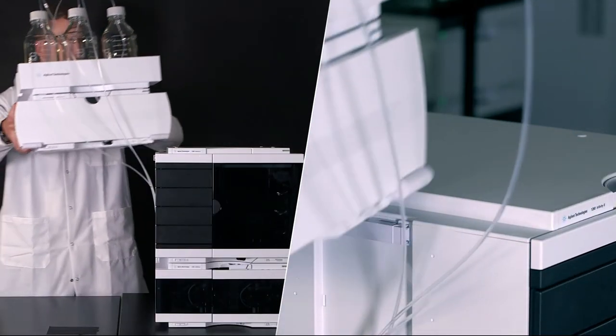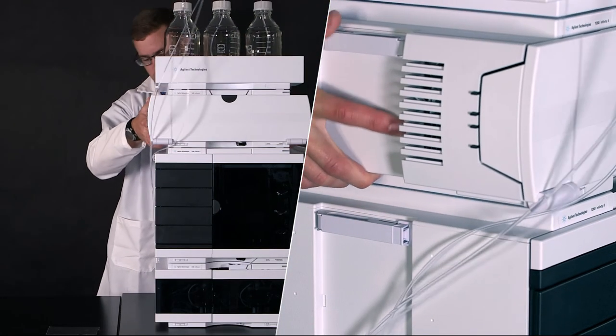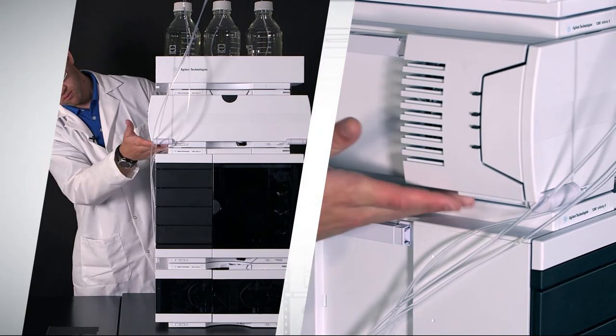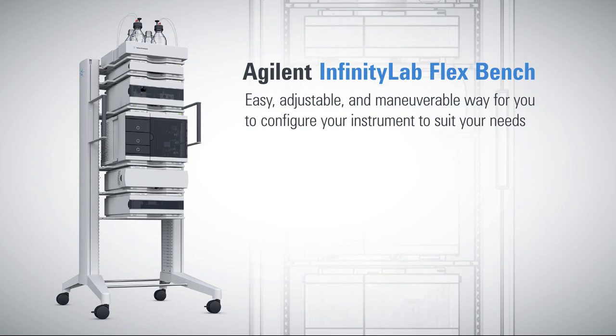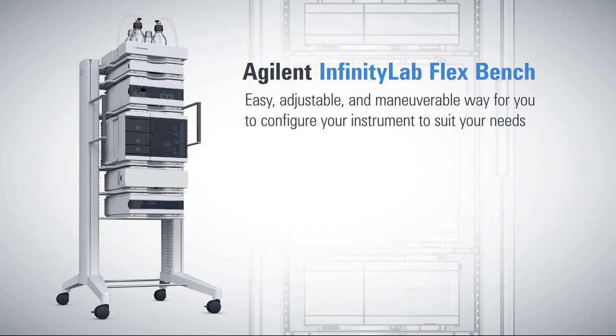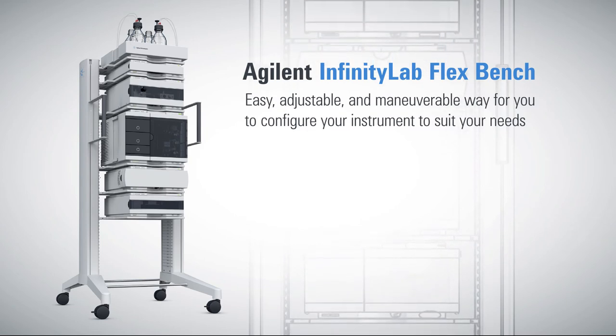You have a number of safe stacking options. Let's go through a few of the most common configurations now. The Infinity Lab Flex Bench is an easy, adjustable, and maneuverable way for you to configure your instrument to suit your needs anywhere in the lab.